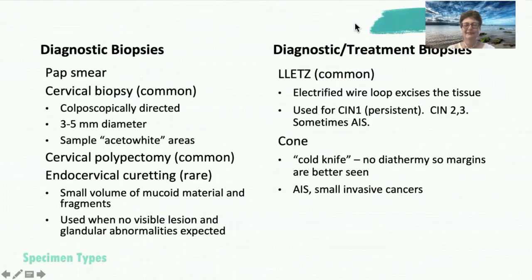Here's my list. When thinking about biopsies, we can often divide them into biopsies that are just diagnostic biopsies and biopsies that are both diagnostic and treatment. We aren't going to talk about pap smears here. It's a screening biopsy rather than a diagnostic biopsy.